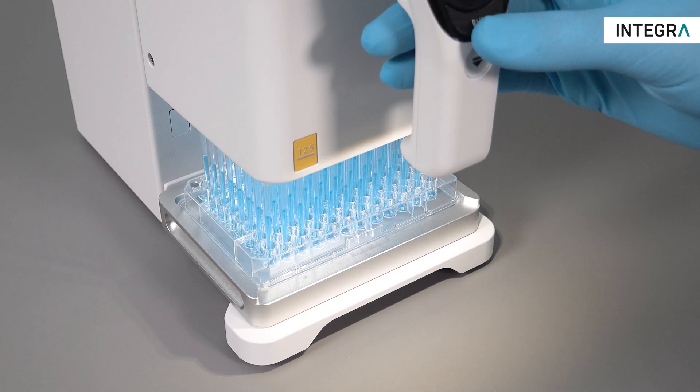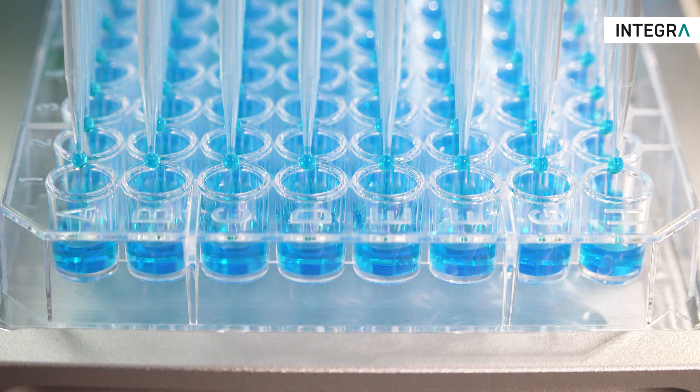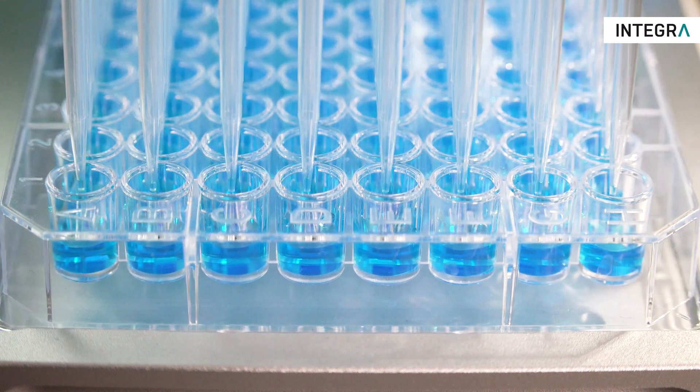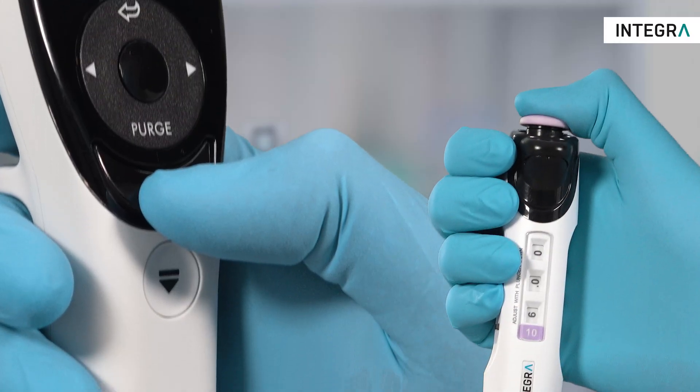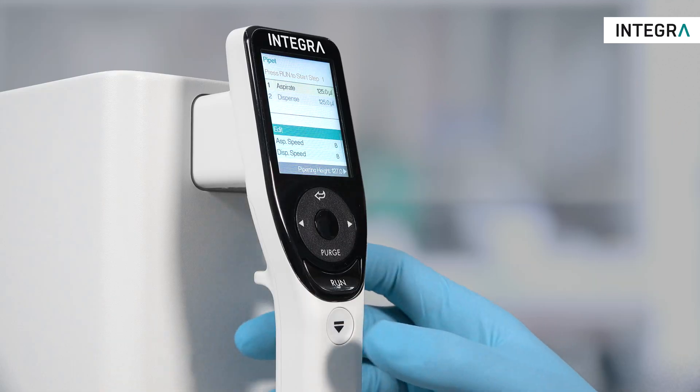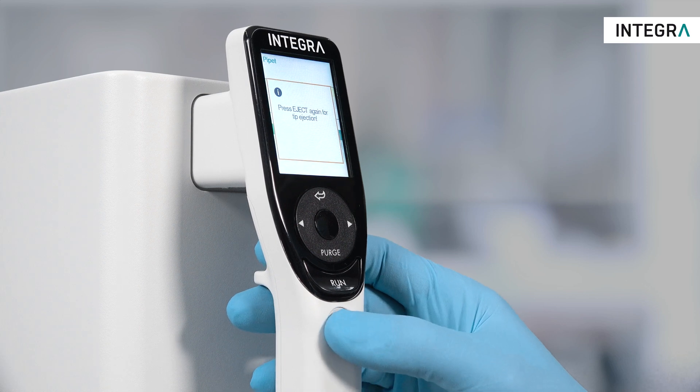If a touch-off is needed after dispense, simply move the plate against the tips. After the last dispense, a blowout occurs automatically, followed by a blow-in. To eject tips, press the eject button twice.